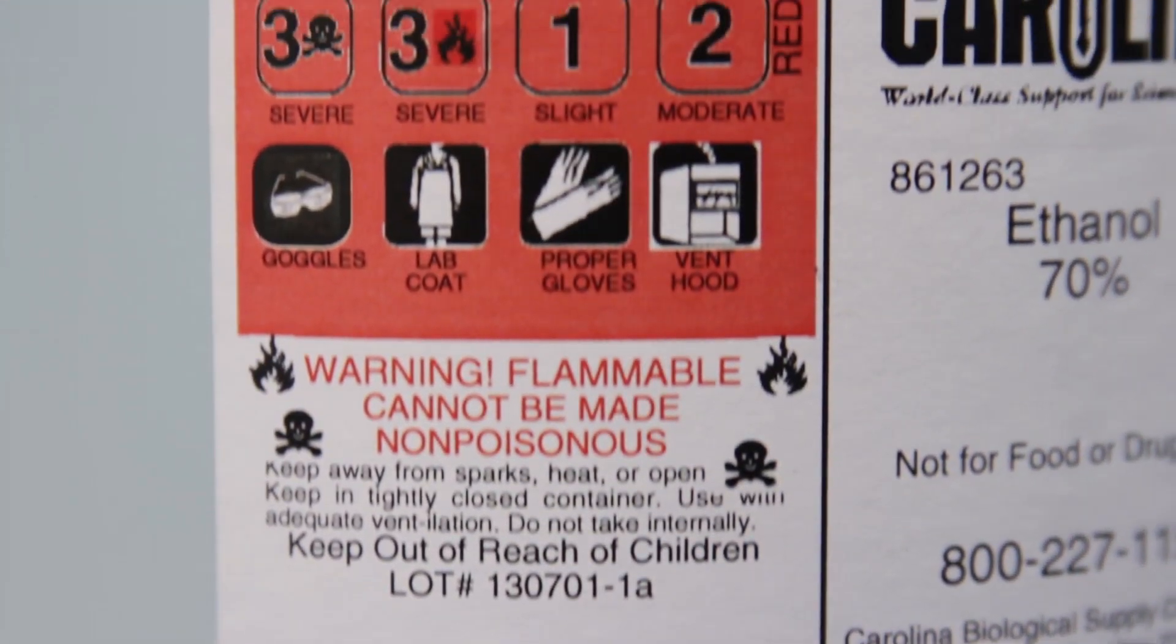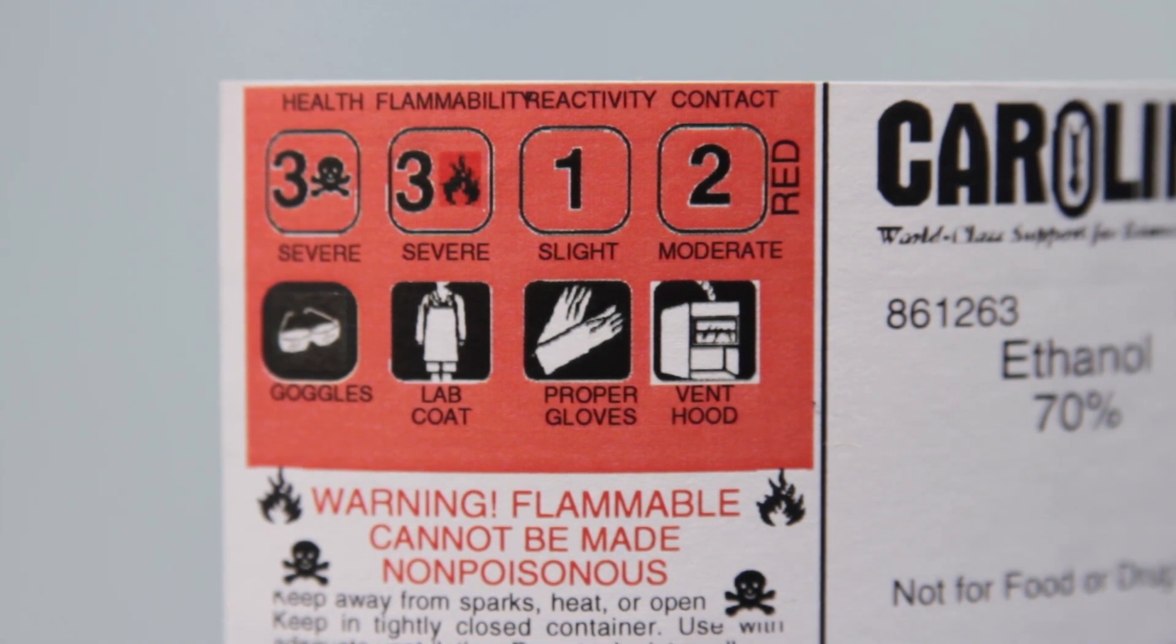Remember that ethanol is a flammable liquid and toxic by ingestion or inhalation.